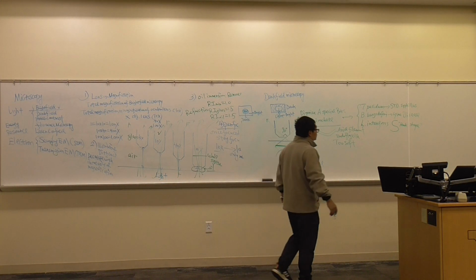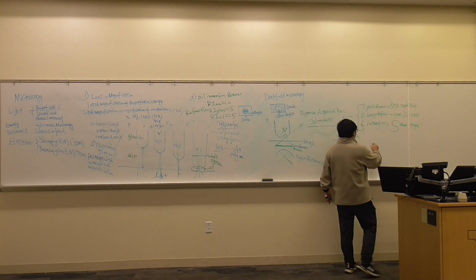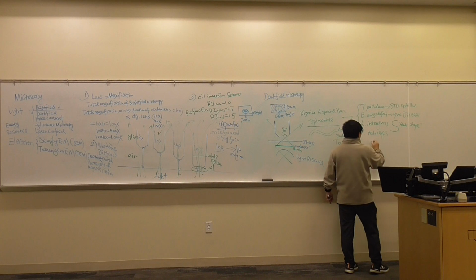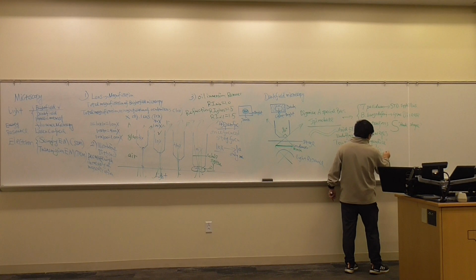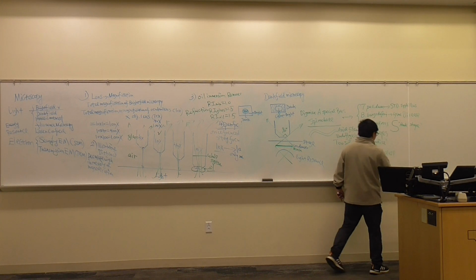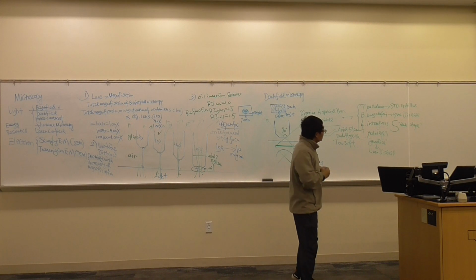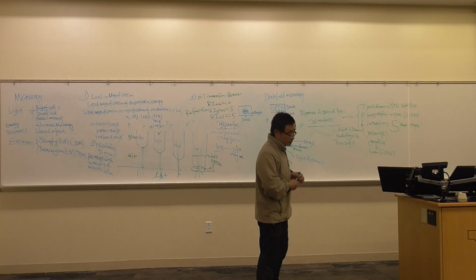You could get contamination. And you get yellow eyes. What is that called? Jaundice. Because it causes liver disease. It's very penetrating. Okay, with these types of bacteria, we need to use the dark field microscope.